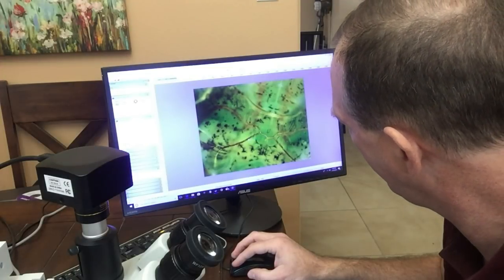Again, this is the head, so this vein is going to the blood. This blood vessel is going to the eye over here, and then this blood vessel is going over to the other eye.